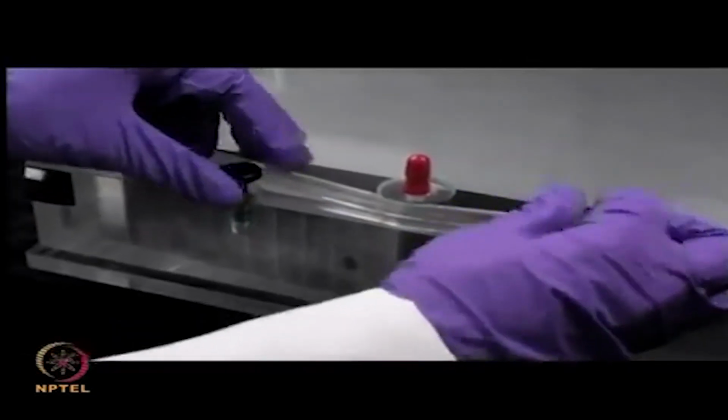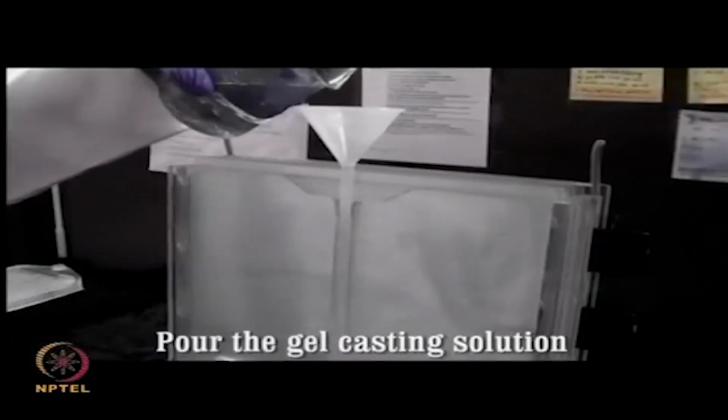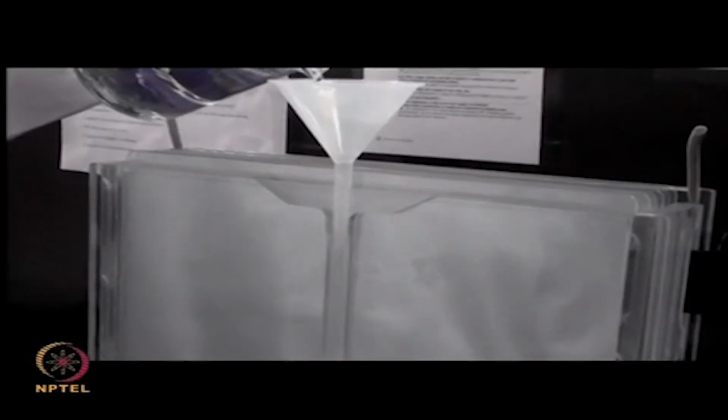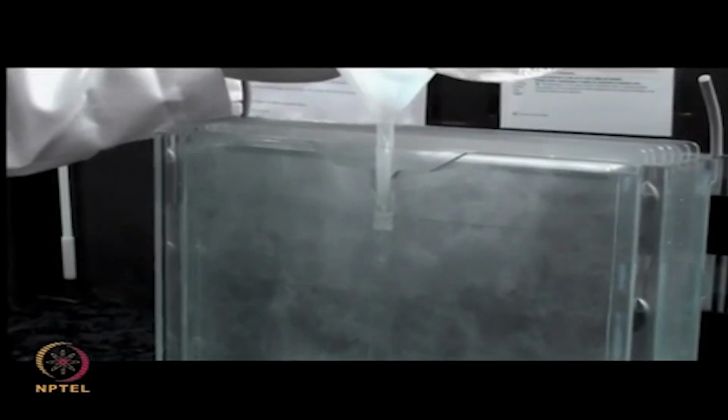Prepare the gel casting solution consisting of acrylamide, bisacrylamide, Tris chloride, SDS, APS and TEMED, and pour it with the help of a funnel into the central channel of the casting assembly. APS acts as a free radical generator while TEMED functions as a catalyst for the polymerization reaction.